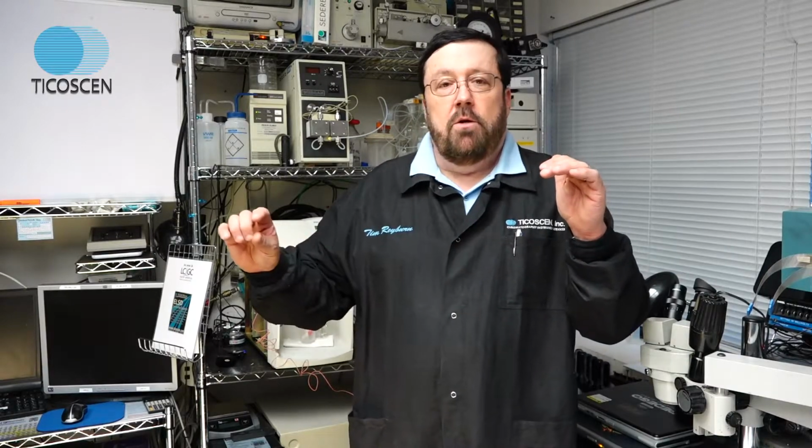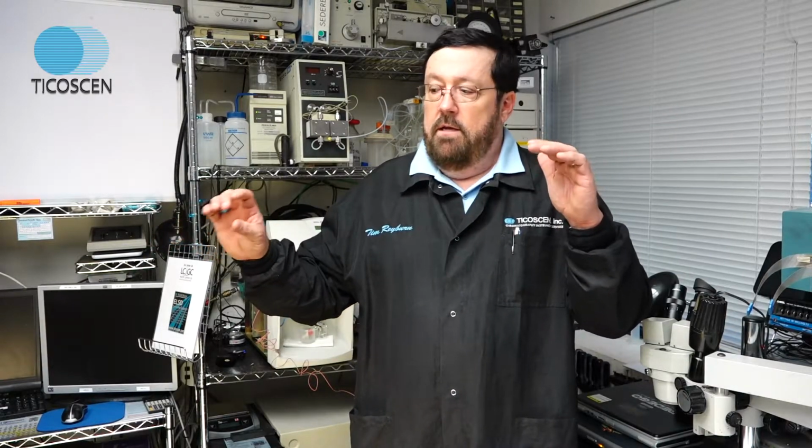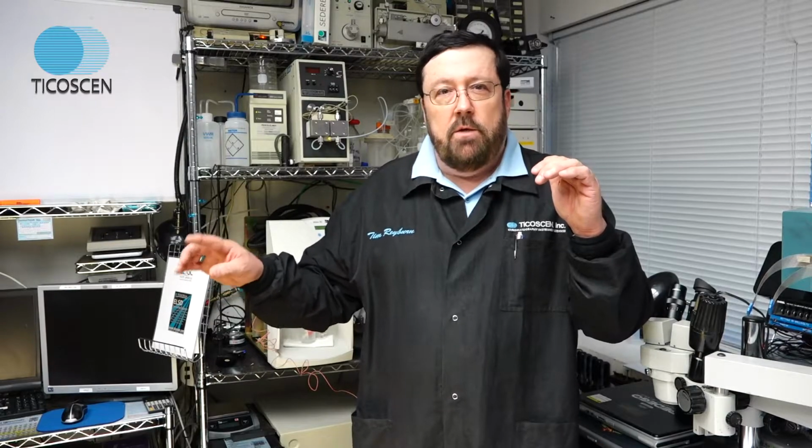So if you have a very high concentration of product that you have to inject and you want to keep it on scale, and you need to be on scale at gain 8, but you have an impurity that comes out 6 minutes out, and it's a very tiny peak, and it's hard to get your LOD or your LOQ levels, the 10:1 and 3:1 ratios.